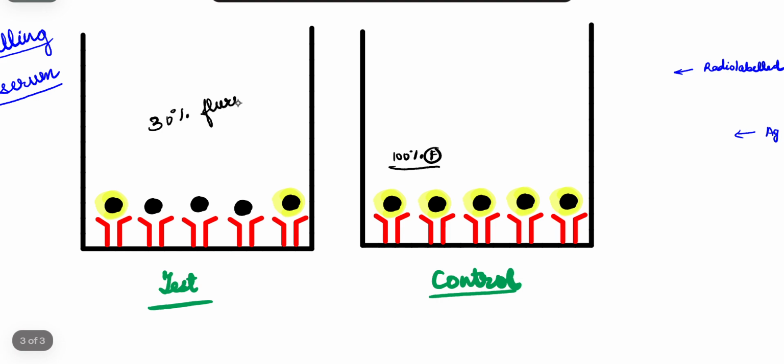So on a comparative basis you can say that here the actual antigen X was present, and because it bound here, the fluorescent antigen had to be removed, and because the fluorescent antigen was removed, the fluorescence overall had decreased. So this is what we call the competitive ELISA. There we have to compare, and the competition is actually between the normal antigen X from the serum and this radio labeled antigen which we have artificially created.